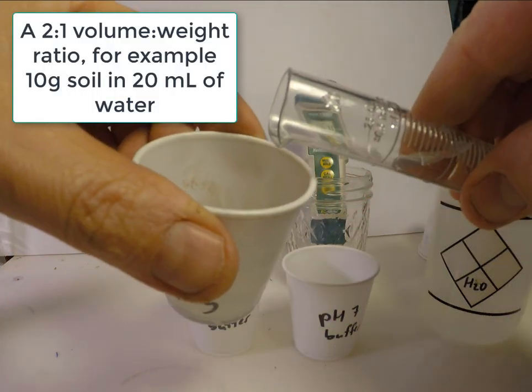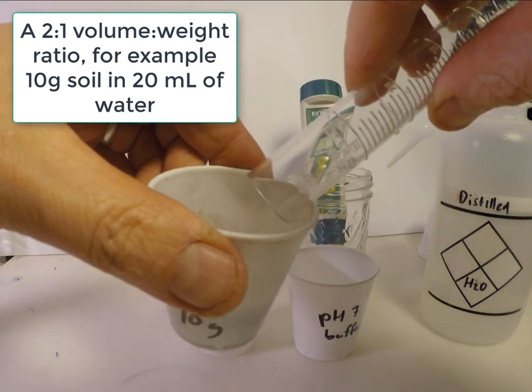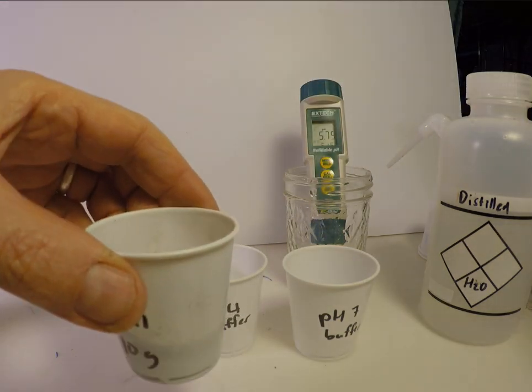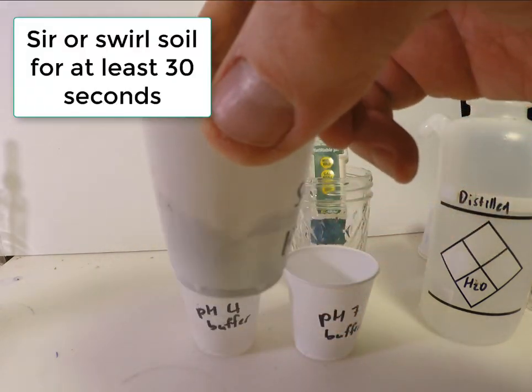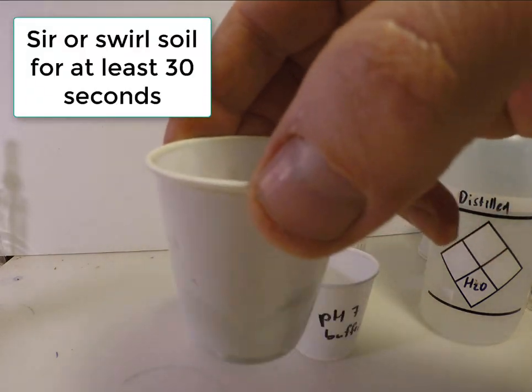In addition, field moist soil could also be used. Soil pH is fairly equivalent between moist and air-dried soil. The soil should be swirled for at least 30 seconds and up to 1 minute.